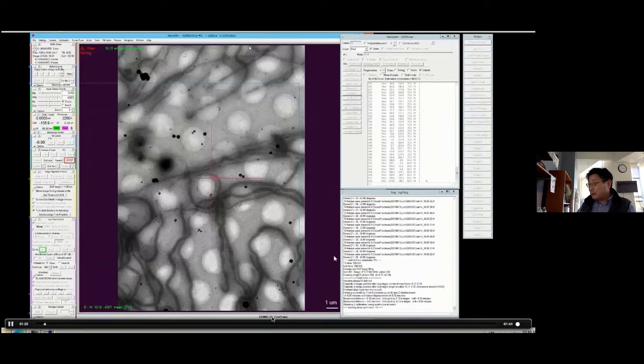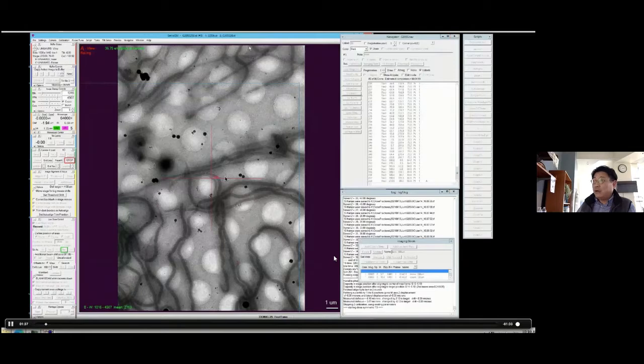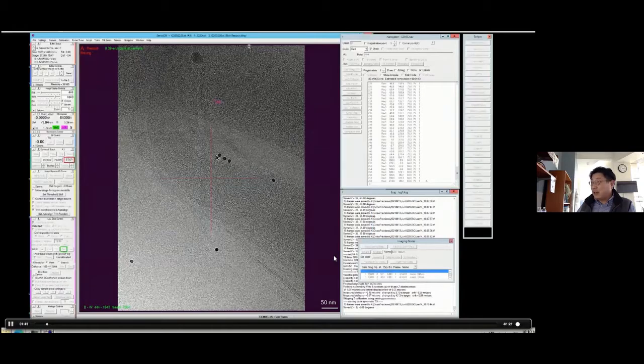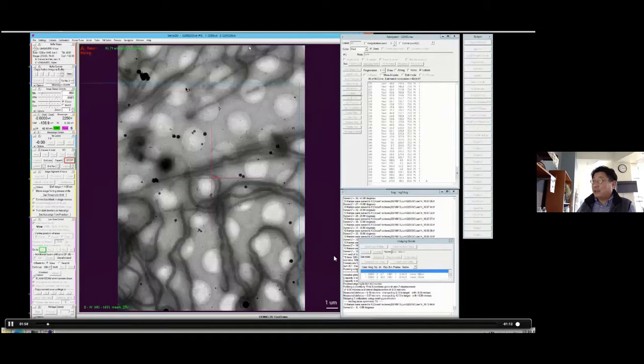And so fast tomo is now used. The idea of fast tomo is to skip a lot of focus steps, using tracking afterwards. Basically you use your recorded image as the tracking target. The first image was taken at 0 degree. At 0 degree, you can see there are multiple 10 nanometer gold particles. There's a bacteria, and here there's another bacteria overlapping. As you can see, this overlapping area is much thicker.